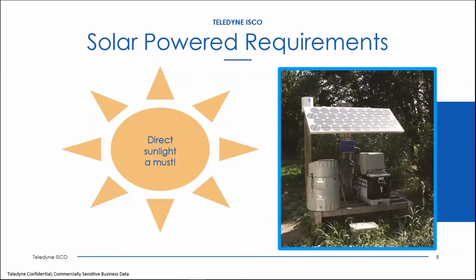With samplers, most of the time a solar panel is just going to maintain the battery. It's just going to keep it at a full charge. Once your sampling routine actually runs, there's quite a bit of current draw off that battery. Most of the time the solar panels keep a little bit of charge on there, but they're not enough to keep up with the whole sampling routine. So after the sampling routine has run, you will probably have to go out and replace batteries when you collect your samples. But it definitely keeps the battery topped off until you actually start your sampling routine.